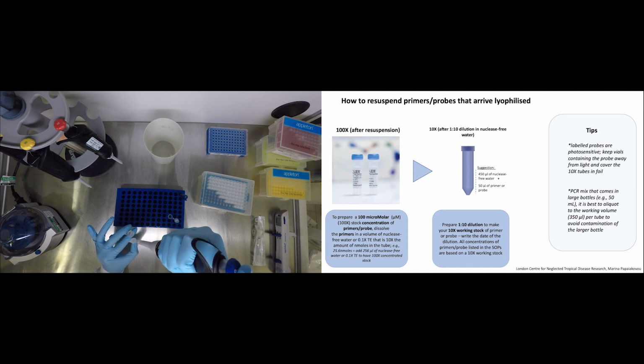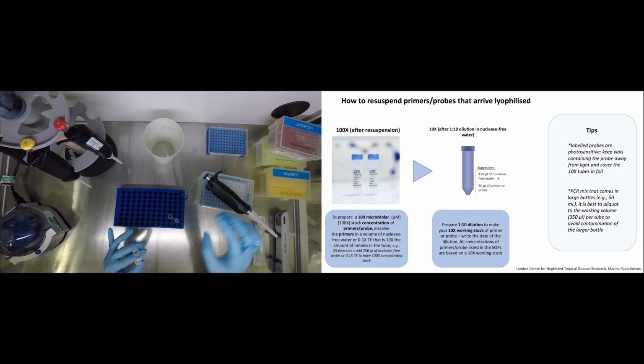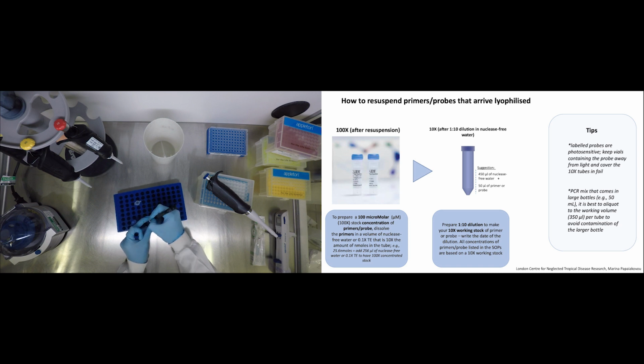Also, make sure you wrap the 10 micromolar stock of probe in foil to prevent exposure to light. The working stock will be the one that you'll be using for all recipes found in the SOP or our published work.